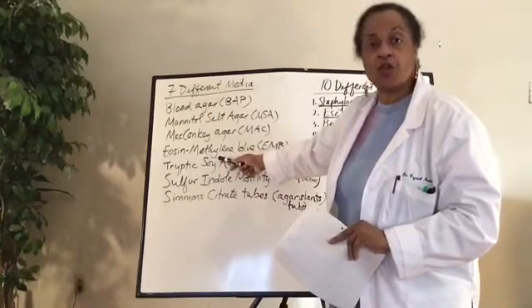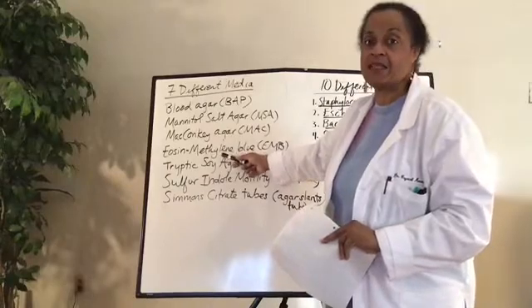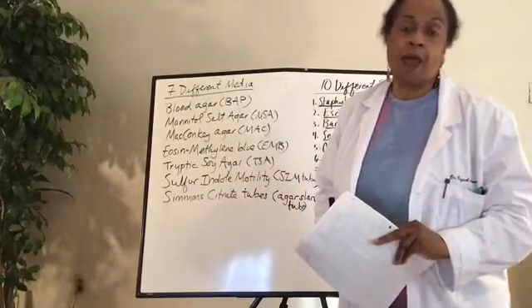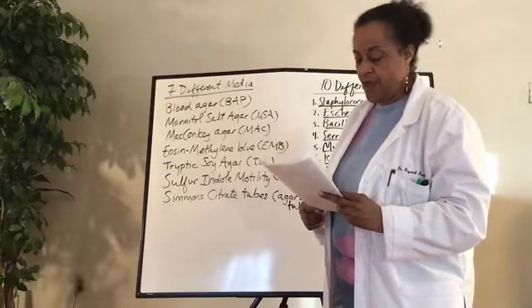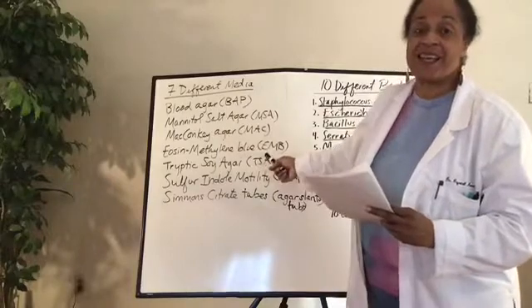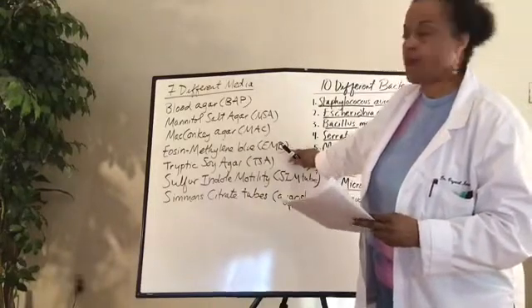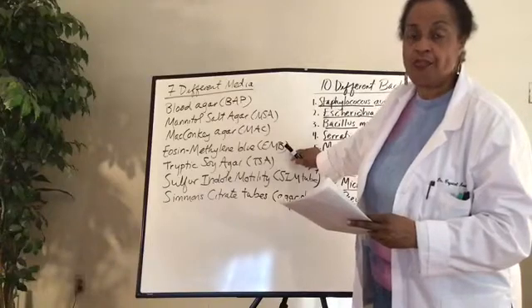You are familiar with methylene blue as a dye. This was put in this medium to make it selective. This type of medium is selective for only gram negatives, right? Only gram negatives. And usually it's the ones that ferment lactose. When they ferment lactose, the gram negatives give a kind of greenish sheen on the agar.